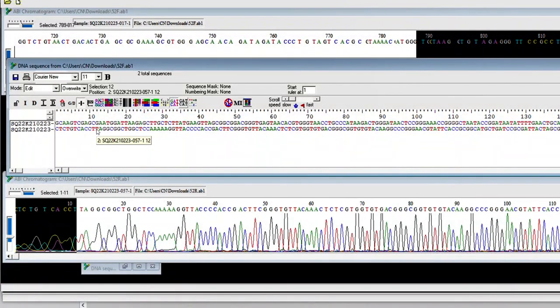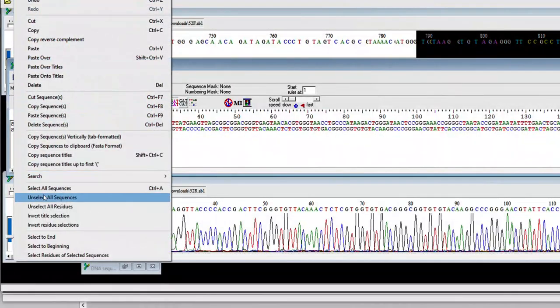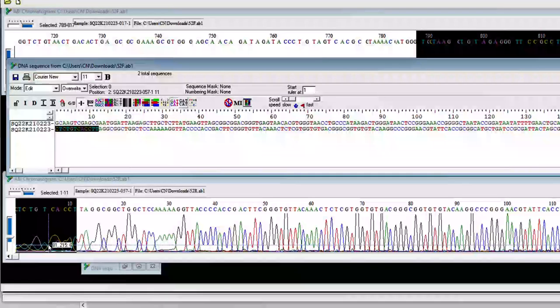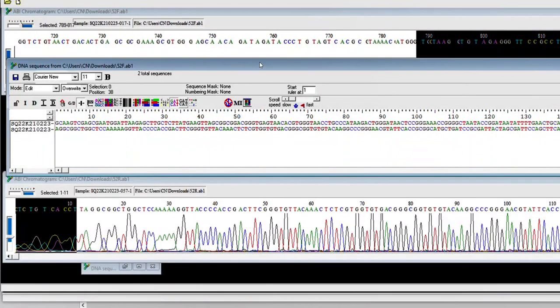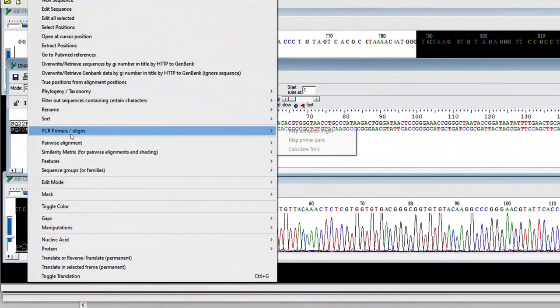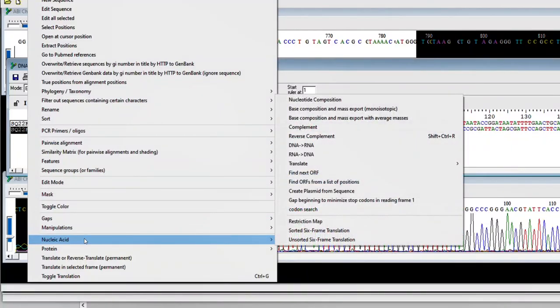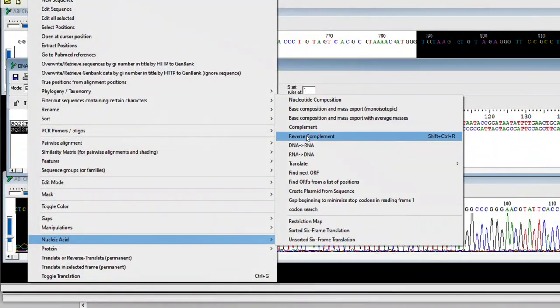We shall take the first T, select Edit, select the beginning, and press the Edit button on your computer. So we have finished clipping the sequences. Now we shall choose this and make the reverse complement. Select nucleic acid, you get sequences, select nucleic acid, and you come and choose reverse complement. So now we have the reverse complement of our reverse.